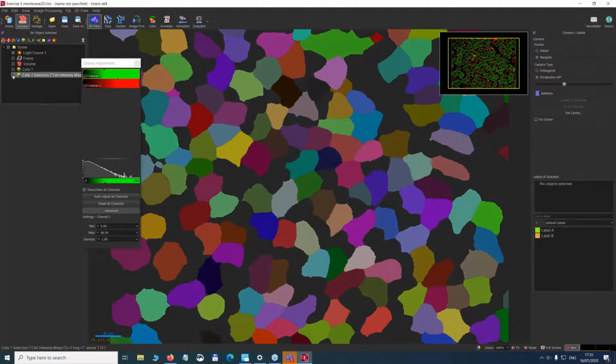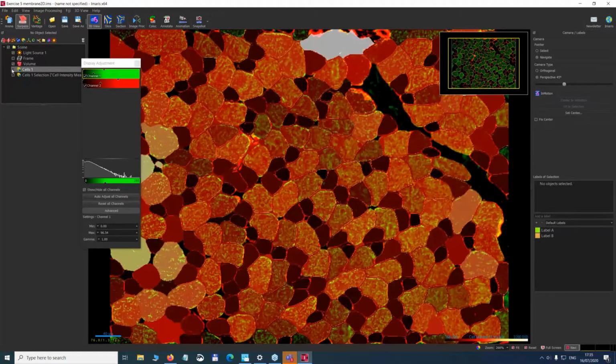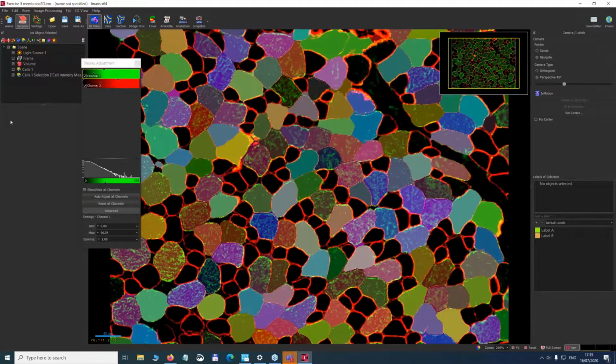So some of it is trial and error, but it's also totally cool for you to send us a data set and for us to help you work it out and then give you some parameters that work well there. So yeah, definitely reach out to us if you haven't already about that. There's some accommodation that it can make, but there is certainly a limit to it. Okay, let me see. Sorry, I'm scrolling through a list here.